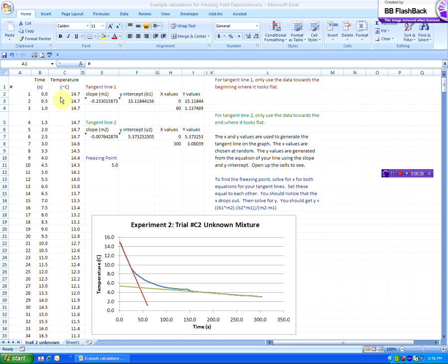If you use the Pasco Explorer, you're going to get a lot of data points because it will collect temperature readings every half second. If you had to do it by hand, the recommended interval was every 15 seconds. But hopefully, if you got it through Excel from the Pasco Explorer, you can import that data into Excel and get a lot more data points to make a nicer, prettier graph. So this blue line here represents the data once it's graphed.